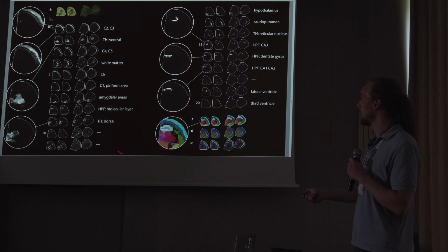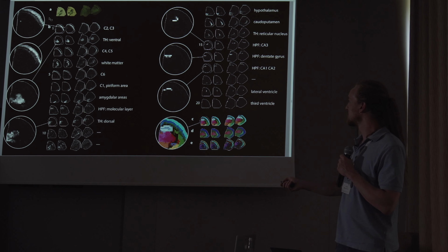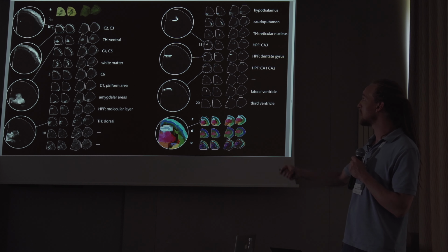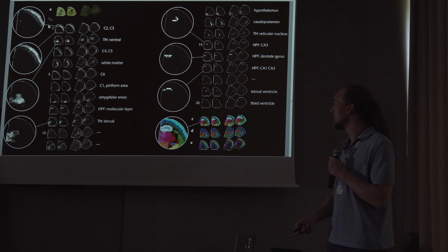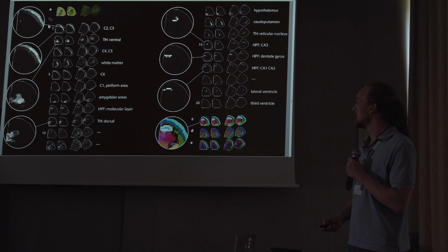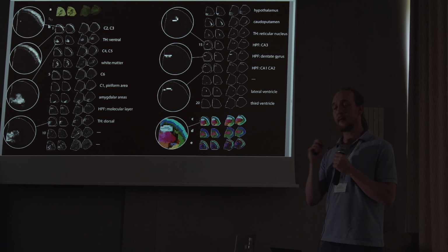And as you will see, for 3 I had to put a dash because I couldn't really infer something that is common here. They do pick up structure that is specific but not shared across the genotypes. So this is one genotype and this is a second genotype. Sorry, individual really. But other than that, 17 of these 20 factors that we identified here have clearly corresponding anatomical regions.